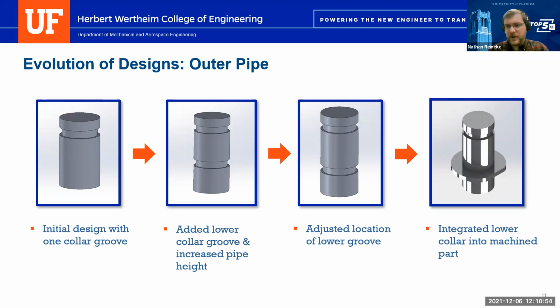We also added a parallel plane that cuts down the side of that groove. This interfaces with the wall of the pipette itself, or the pipette housing itself. This allows it so no rotation is occurring when the NEMA 17 motor is moving, and just sets another constraint.